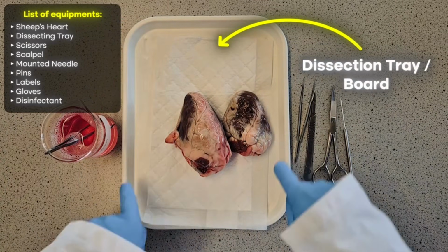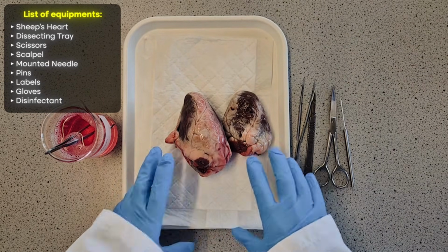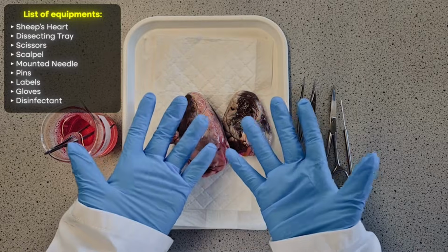And I've got my dissection board, and we actually use these absorbent pads to help absorb any of the liquid and blood that might come out of these. All of that needs to be tidied away in a separate biohazard bag at the end of the practical, as well as the heart and any gloves that are used.